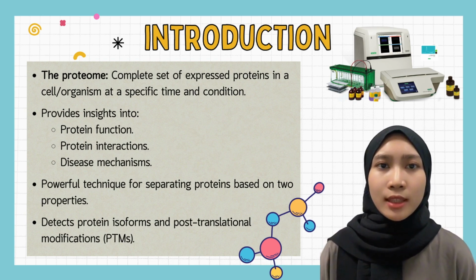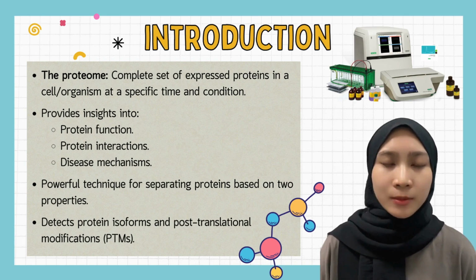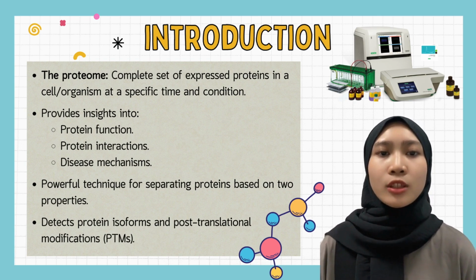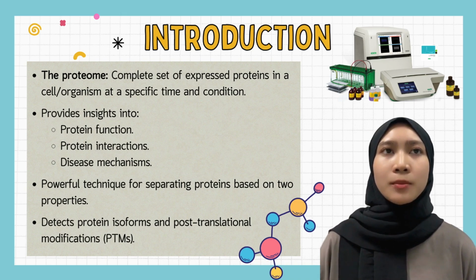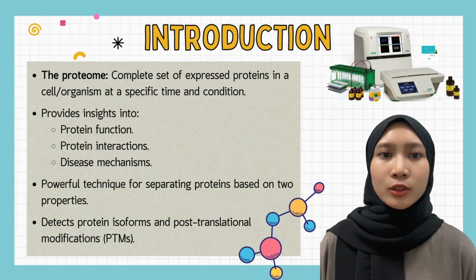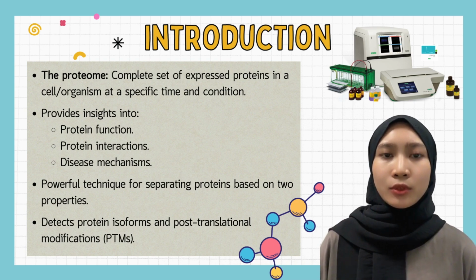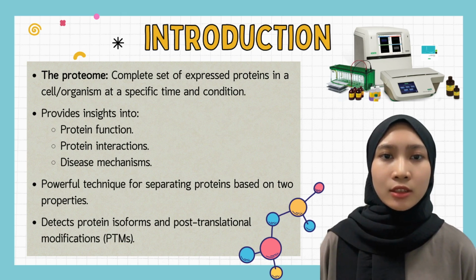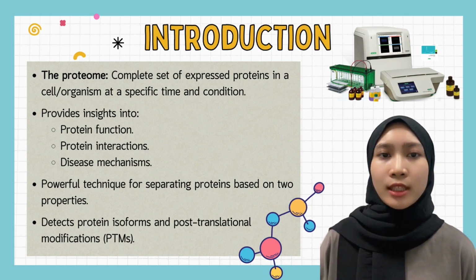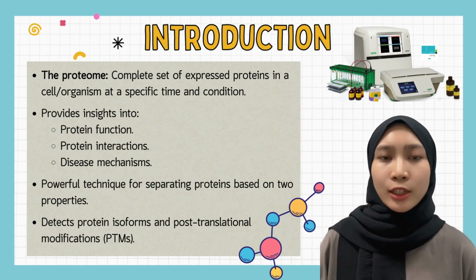This high resolution method allows for the detection of protein isoforms and post-translational modifications, which are crucial for understanding the proteome. The proteome represents the complete set of expressed proteins in a cell or organism at a specific time and also under defined conditions. Since proteins can exist in multiple isoforms due to post-translational modifications, or PTMs, the proteome reflects this diversity. So, studying the proteome through techniques like 2D SDS-PAGE will provide insights into protein function, interaction, and also disease mechanism.